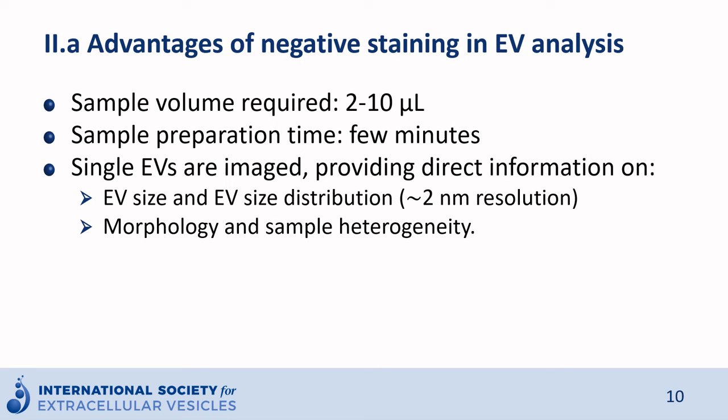What are the advantages of negative staining in EV analysis? The sample volume required is small, just a few microliters. The sample preparation time is short, a few minutes.